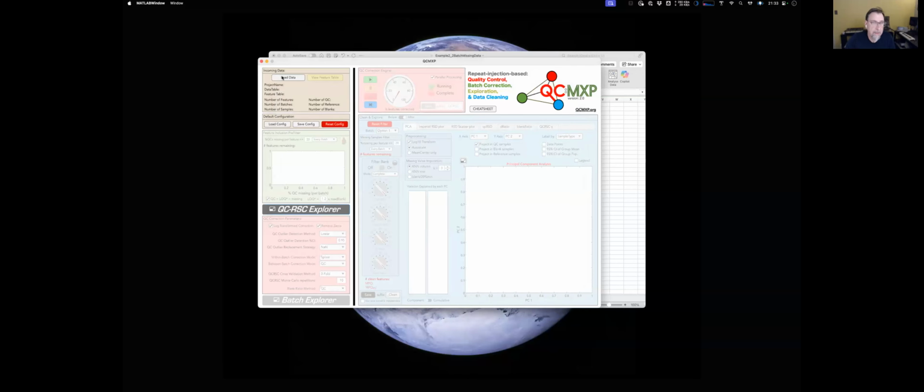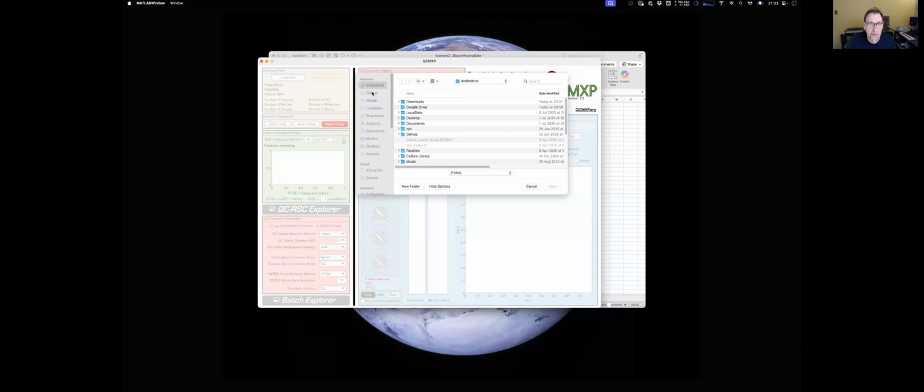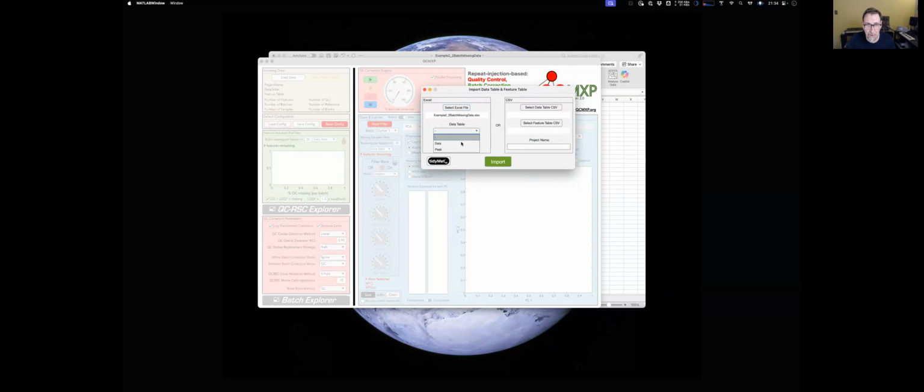So now if we load in a data set, I'll go to my GitHub page. And you can download the test data sets from the GitHub page. They've all got certain features about them that make them particularly interesting. I'm doing this one here just for speed because it's a reasonable size and it means that we won't be sitting around waiting for the algorithm to work. So we load it in. As I said before, that data has to be in the tidymet format.